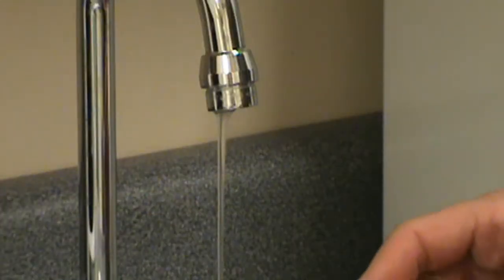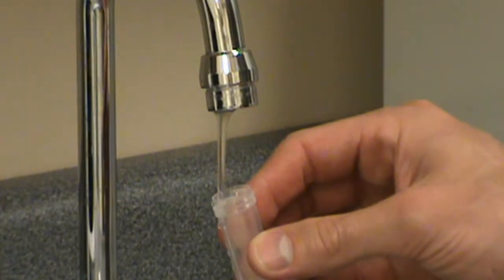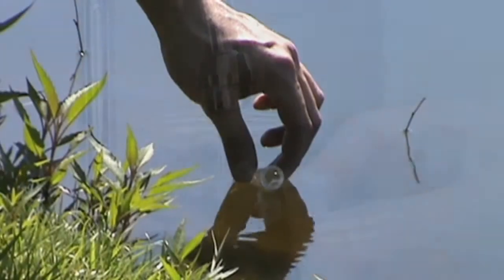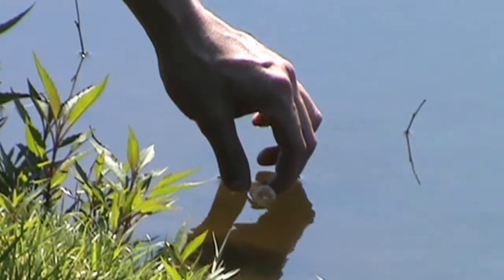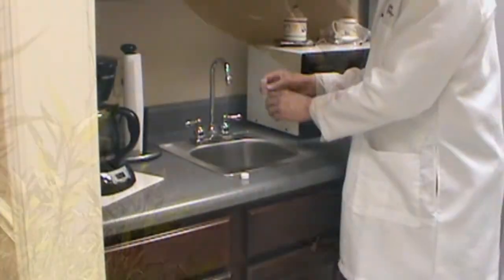Slightly tilt the vial and fill it to the 5 mL mark. Make sure you don't wash any of the media out of the vial by overflowing it with water. When collecting from a lake or a stream, slightly tilt the vial and partially submerge it to collect the sample.